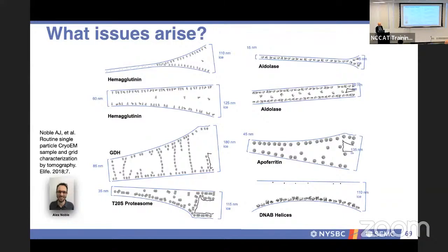And so partially when we're doing our sorting and data analysis, we're throwing away a lot of particles, again, primarily because we don't understand sample preparation that well. And some of the particles we're removing could just be due to processing, because usually when you're focusing, you're looking at one image plane versus another.